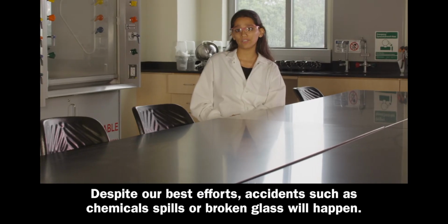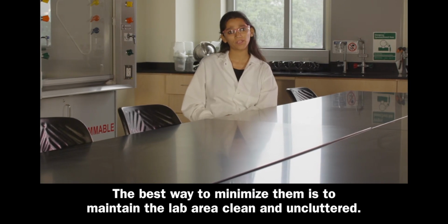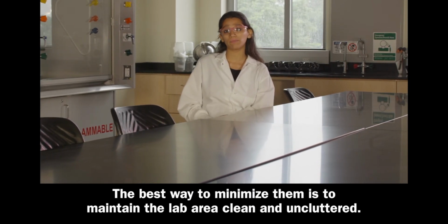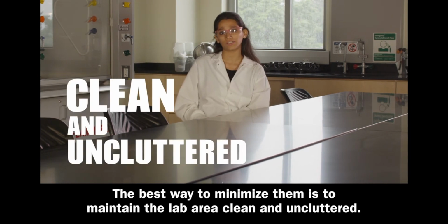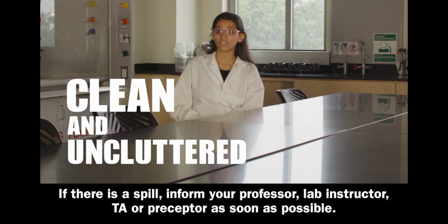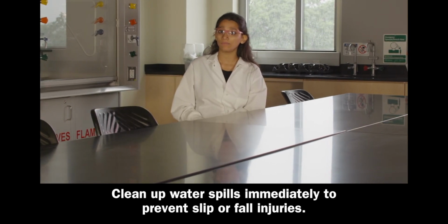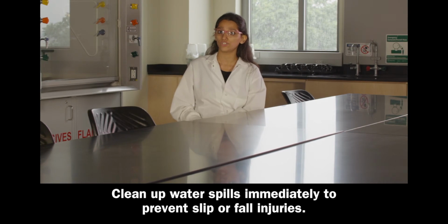Despite our best efforts, accidents such as chemical spills or broken glass will happen. The best way to minimize them is to maintain the lab area clean and uncluttered. If there is a spill, inform your professor, lab instructor, TA or preceptor as soon as possible. Clean up water spills immediately to prevent slip or fall injuries.